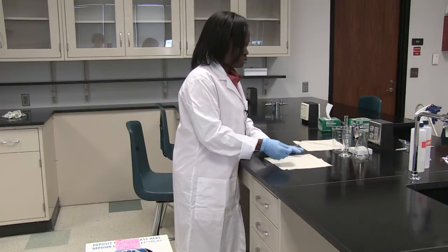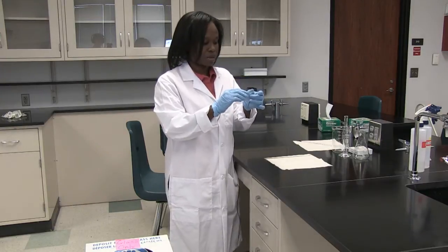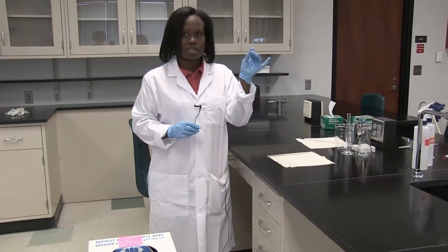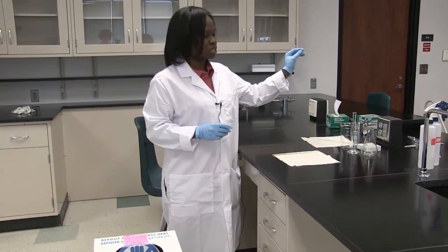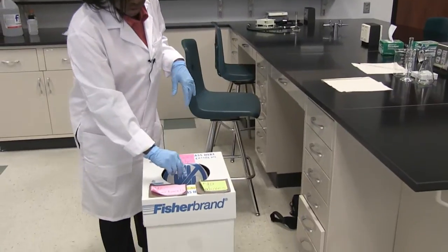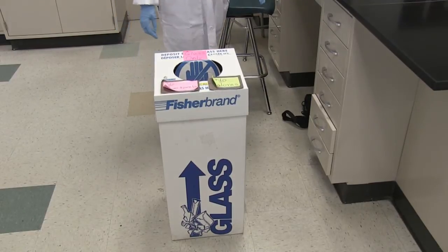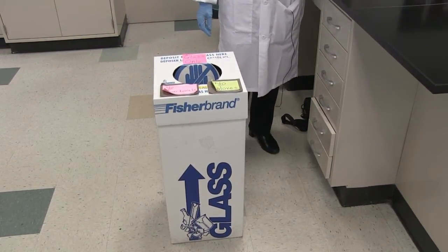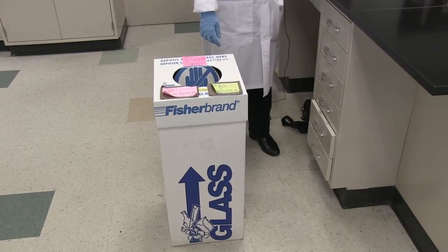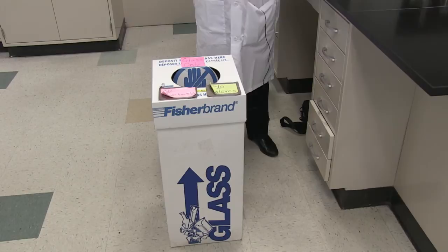If you use your glassware — this is an example of one, a cover slip, which I've used already — you need to dispose of it in the right container. Don't dispose of it in the regular trash. Dispose of it in this glass container here; it's a square box with glass at the sides. It's very important that you do not put it in the regular trash because the person designated to dispose of the garbage could get accidentally cut not knowing that there was glass in there.